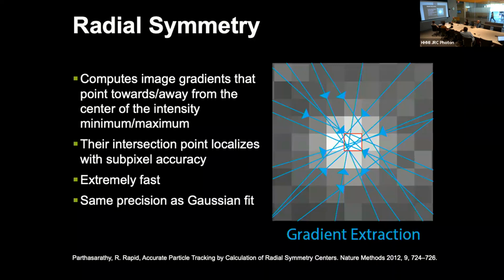We started thinking it could be a cool technique. On top of this, we could combine it with robust outlier removal. If two things are very close to each other, you can find which pixels belong to one spot and which to the other. We'll talk about it later. Yeah, that's basically how it all started.